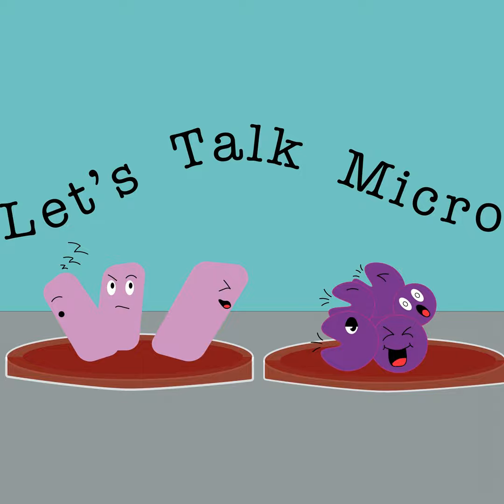So I had to think ahead of time, how was I going to do this in a safe way? And what dye would be the best dye to use and would be an easy dye to dispense. So our lab safety supervisor suggested methylene blue. And when I looked into it, that looked like it would be a good choice. So they could pick a specimen like yogurt or any kind of fermented dairy beverage, things like that, dairy product.